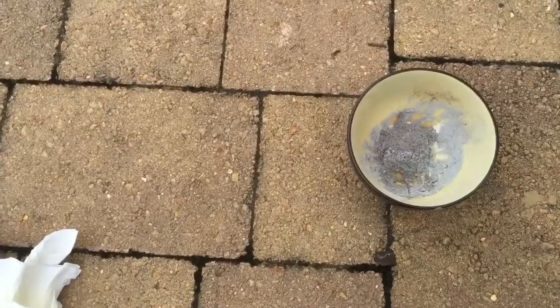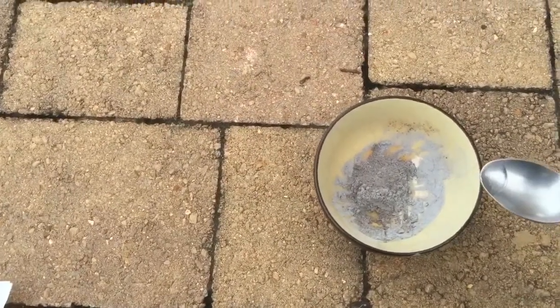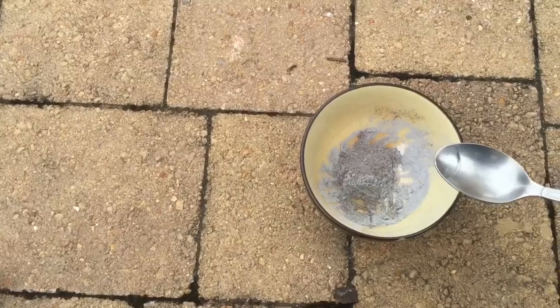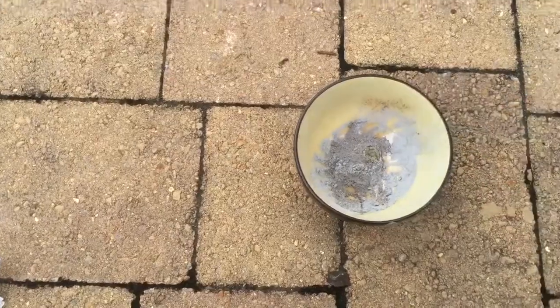Now to start this whole thing off I'm going to add a little tiny bit of water to speed up the reaction. You can see it's already started — the iodine has already started to vaporize a little bit, but the water will get it going much faster.